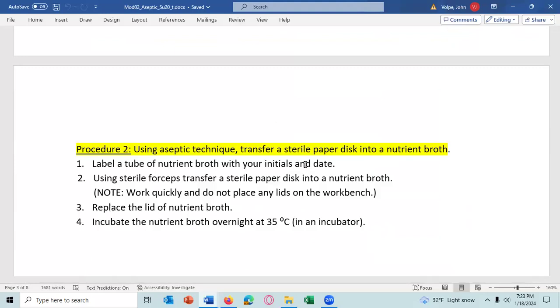You don't want to sterilize them by sticking the forceps in the Bacti-cinerator so that the tips turn red hot, because the heat of the metal forceps will just go right up the forceps, and then you won't be able to hold them. Any question about that?